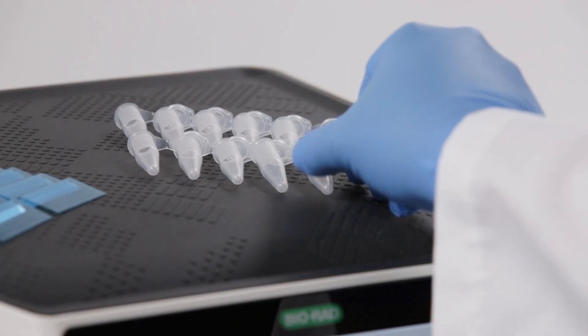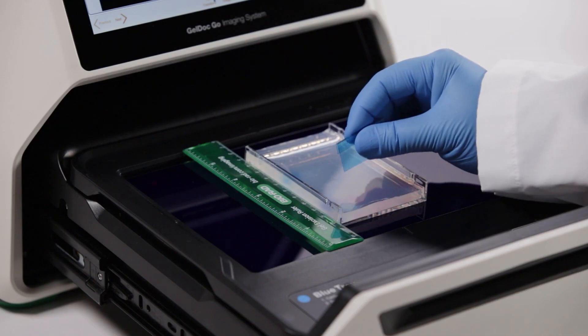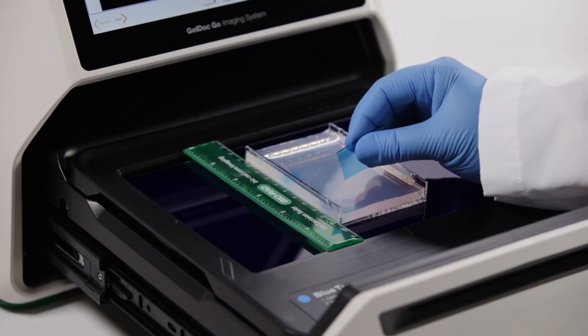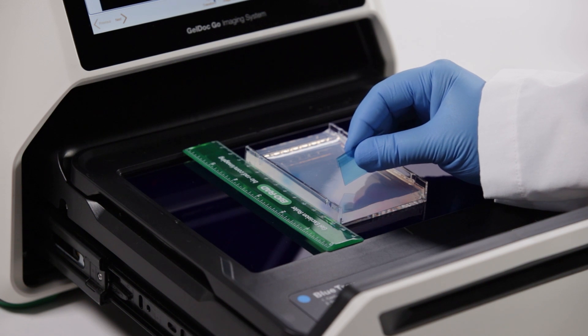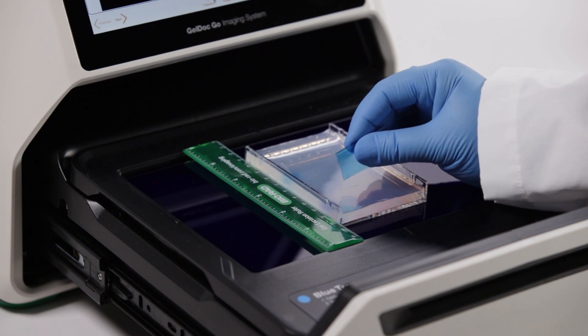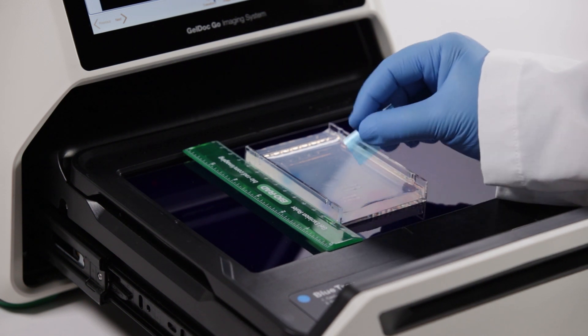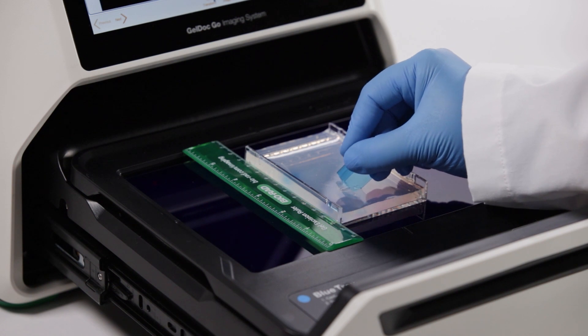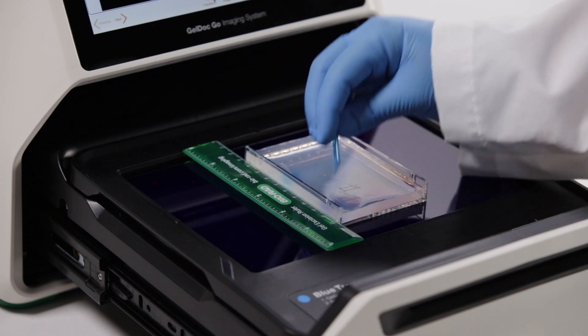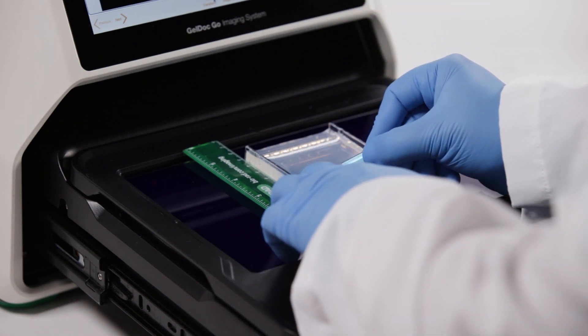To excise your band, grab a clean and unused plastic cutter. Use only one per band to eliminate cross-contamination. These plastic cutters will also reduce the chance of harming the glass tray or yourself.